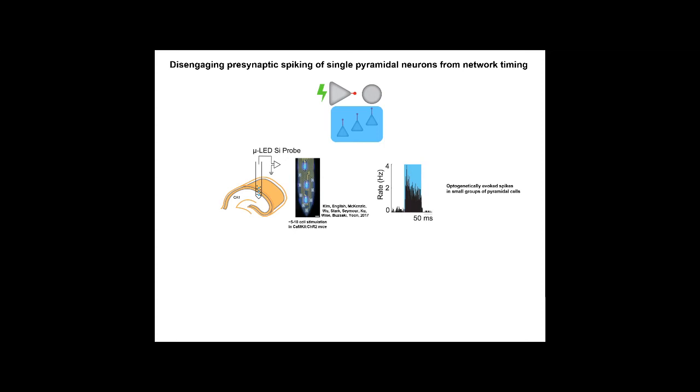I should say this isn't a wild-type mouse. It's a CaMKII-Cre mouse, so it expresses the Cre recombinase selectively in excitatory neurons in CA1, that's the pyramidal cells. This is crossed with the Allen Institute Ai32 mouse, which has channelrhodopsin in an orientation with loxP sites, such that it doesn't express channelrhodopsin unless Cre is also present. So we crossbred these mice, resulting in channelrhodopsin only in pyramidal cells, which has been verified before.